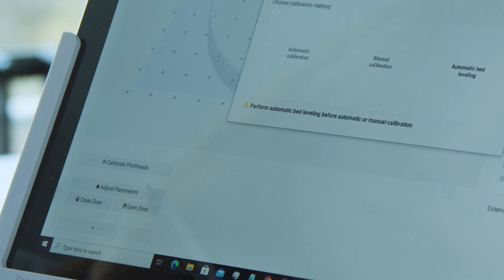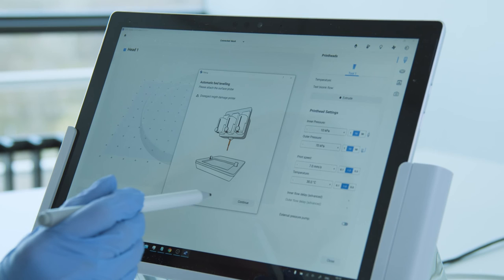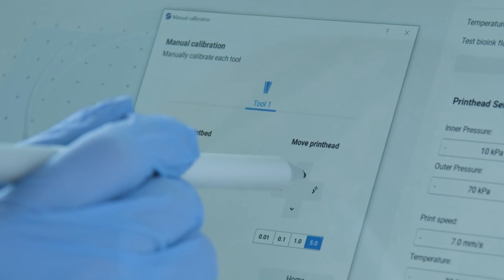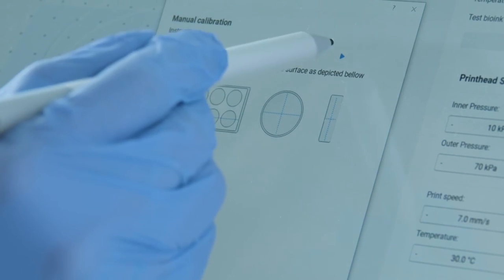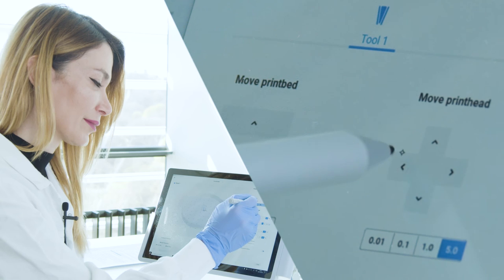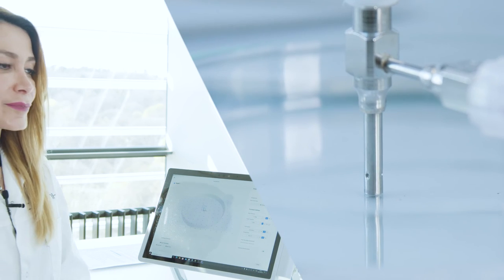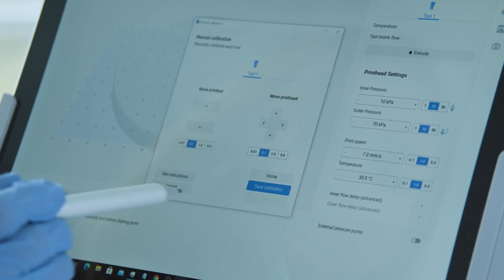Press this tab to calibrate the print bed and printheads. Press auto bed leveling, adjust the probe here, and you are ready. Then for the coaxial nozzle you should go through manual calibration. You can find the instruction for calibration of different types of plates and Petri dishes here. Select the spot in the center of the Petri dish and make sure that the nozzle is touching the surface — this is perfect. Save the calibration and done.